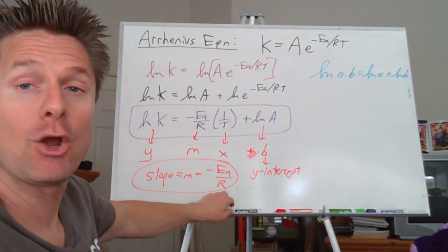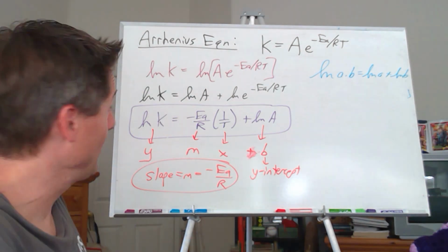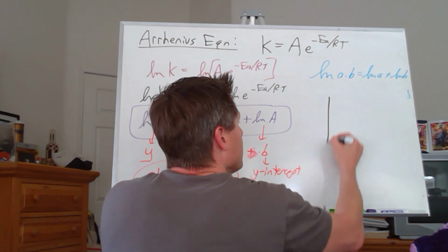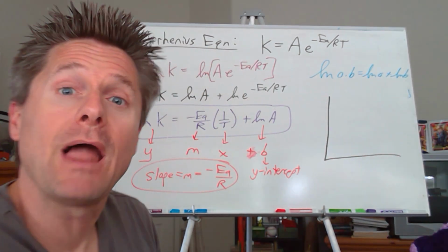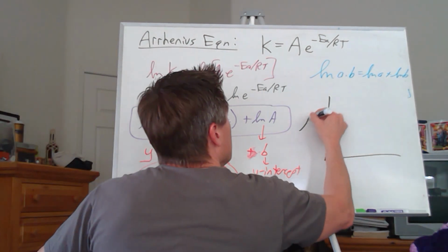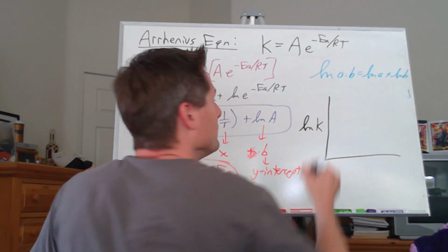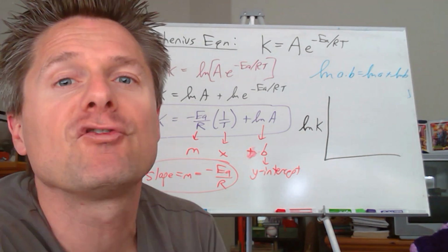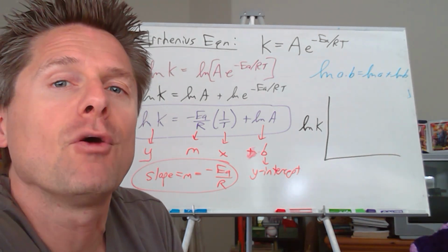Now if we make a graph, right? The chemists are always trying to get things in a y equals mx plus b. Let's make a plot. And you're going to make this plot for this lab once we get the data. If we plot the log of the rate constant, you'll be able to calculate the rate constant, and this is in your Prelab in your general chemistry notebook. I'm not going to do this for you.